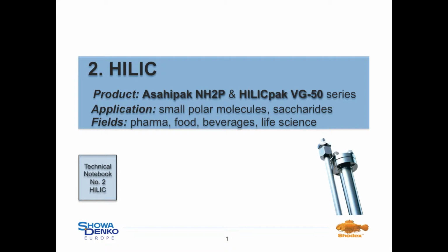If you need more detailed information about the HILIC mode as well as about applications, please take a look at our technical notebook number 2 after this tutorial.